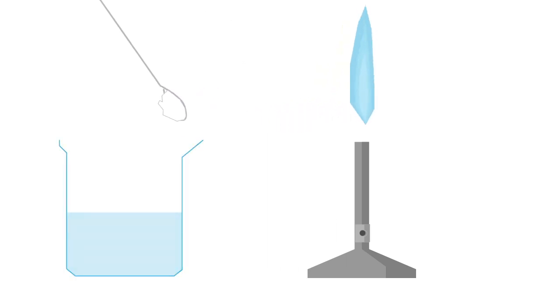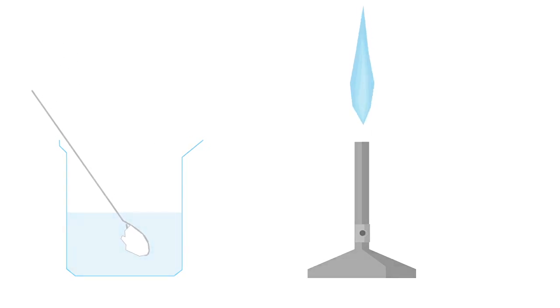Ensure that the nichrome wire is adequately cleaned between each test, or contamination will occur, and the flame color produced may not be strong.